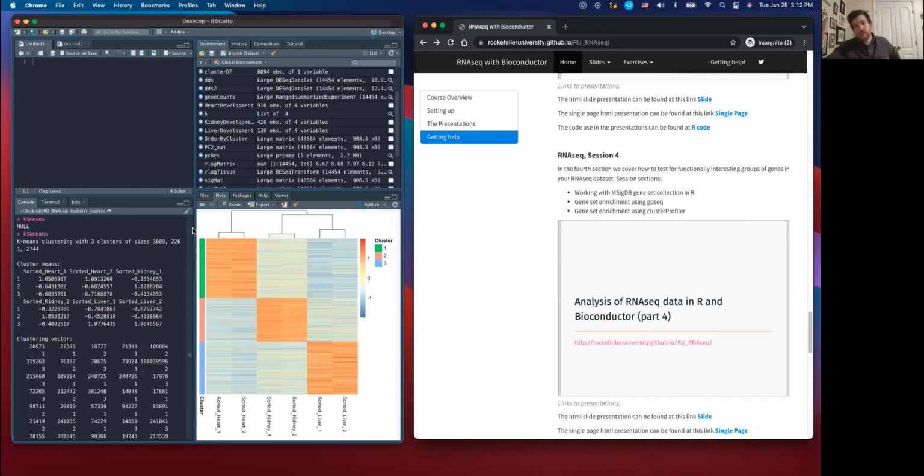But it all depends on what your data set is, because there might not be something that is a nice standard to compare to. You can see how, even with this nice data set that we use a lot for training, it doesn't correspond necessarily to liver development. Maybe that's because at this point the liver's already developed. I don't know enough about this data set to know exactly why those overlaps might not exist. But that's when the experts with their specific data can ask the better questions about how to analyze, what gene sets to use, and things like that.